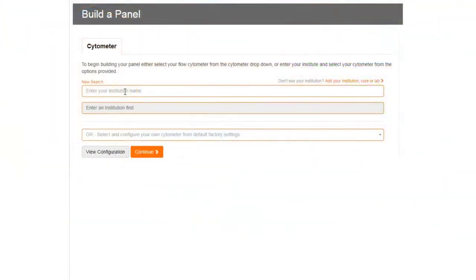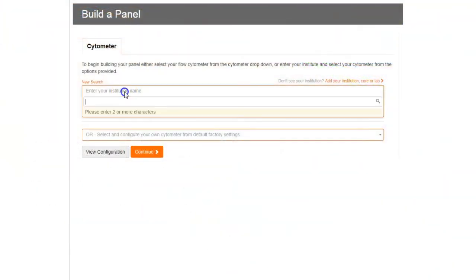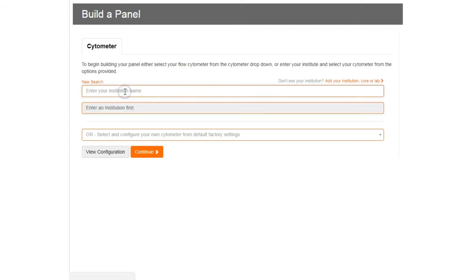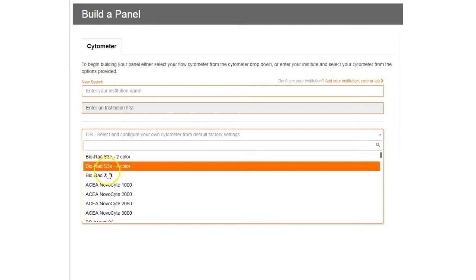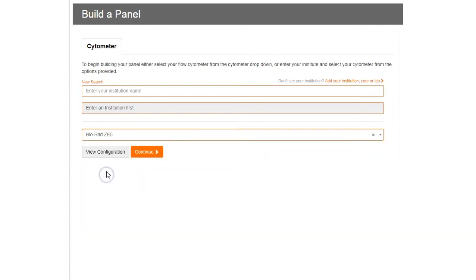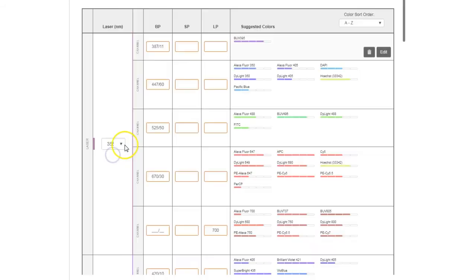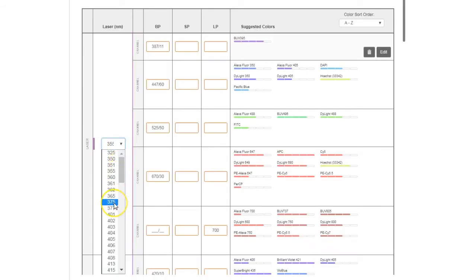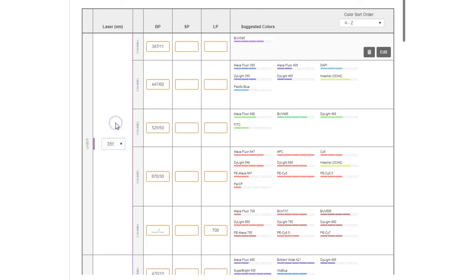To begin building your panel, either select your institution or a specific instrument, which instantly loads your instrument configuration and settings. Clicking on View Configuration allows you to modify the lasers and filters to meet any custom specifications.